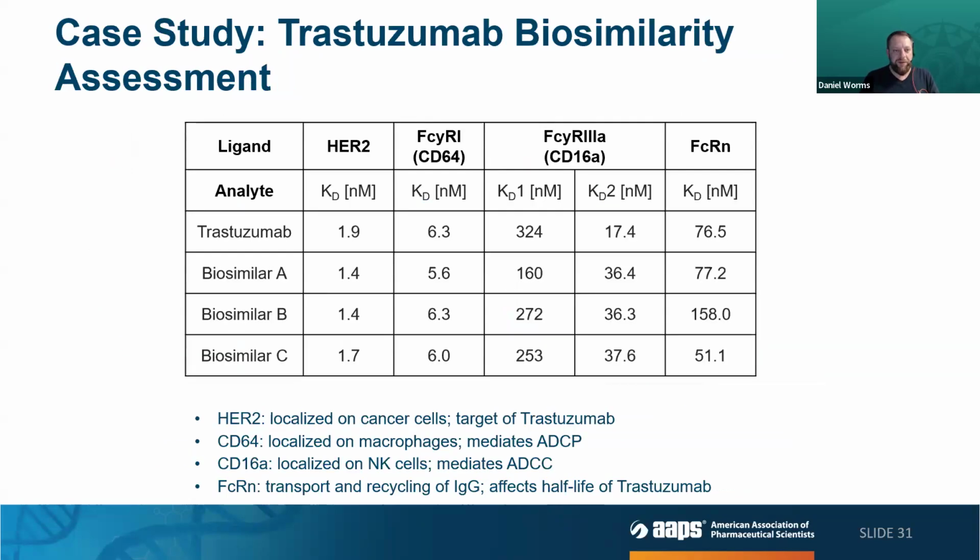So related to the previous slide, I would like to show you also a case study of a biosimilarity assessment where 3 different biosimilars were compared to the originator trastuzumab. In that case, we did not test only the main target, HER2, but also Fc receptors like CD64, CD16A, and the neonatal Fc receptor, FcRn.